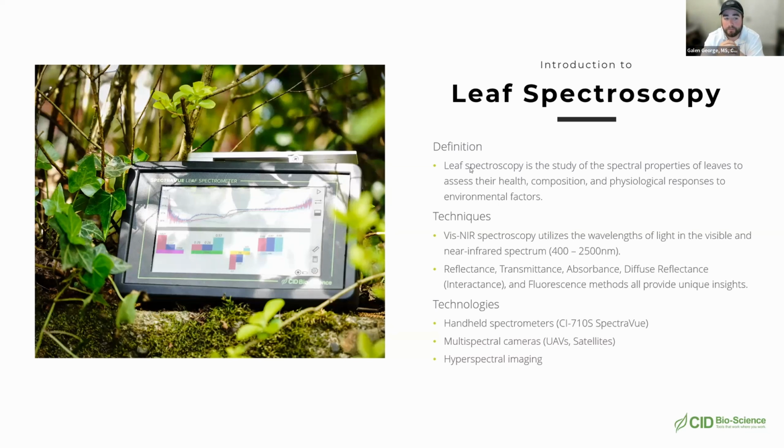So when you try to take measurements and you only have one portion of that optical window covered, then you're going to get some weird spectra, because you're going to have an artificially inflated spectrum, because light is just 100% transmitting through on both sides of that conifer needle or that blade of grass. And so it's going to cause some issues with the detector. So when you're using it with the small leaves, you are just going to have to take the approach of it not being an individual leaf sensor at that point, unfortunately.